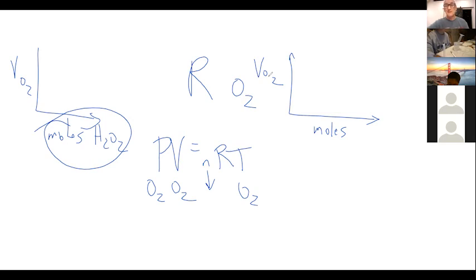That's not right. It is if there's a one-to-one relationship between moles of oxygen and moles of peroxide, but is that the case? How do I know what the relationship is? What do I need to refer to see the molar relationship between hydrogen peroxide and oxygen gas?